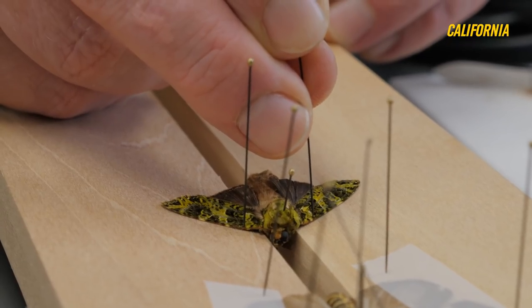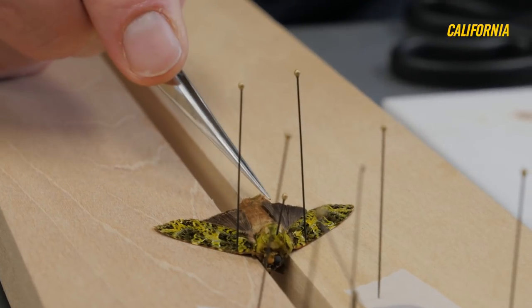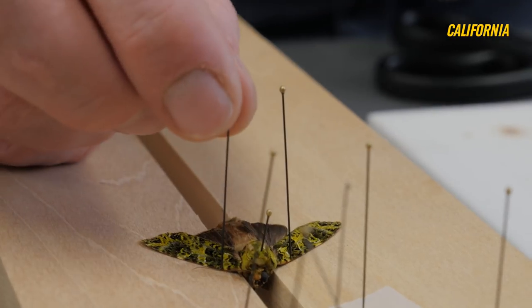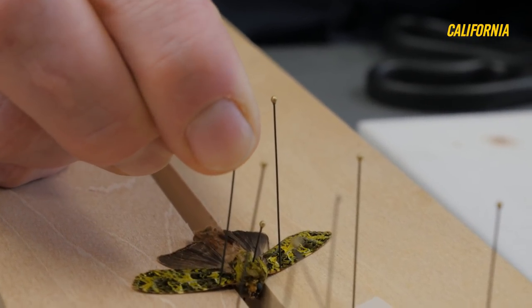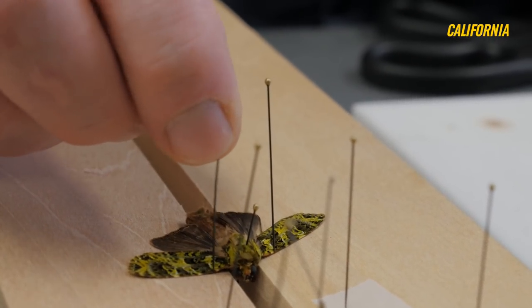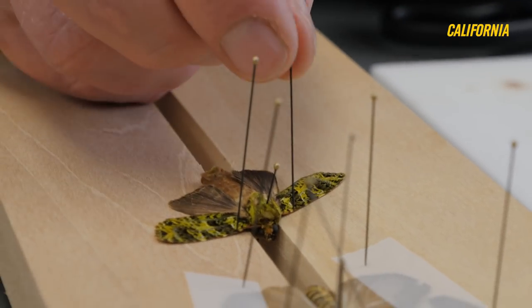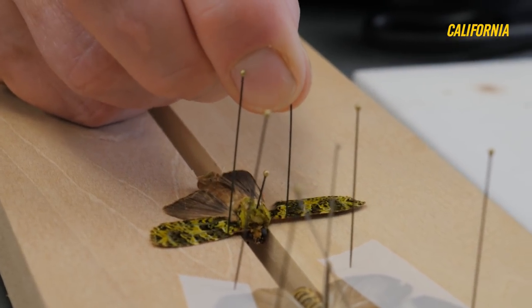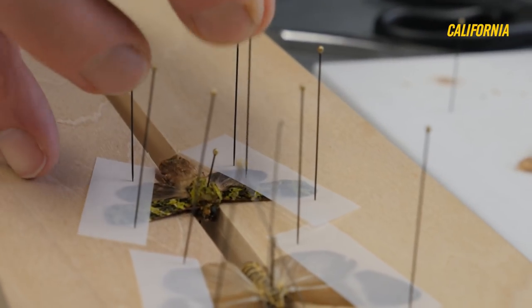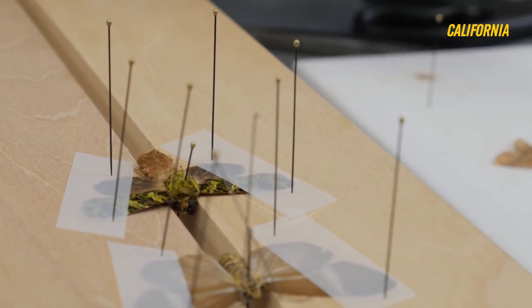These wings have veins running through them that give them their structure and rigidity when they're flying. I'm putting the pins right behind some of these thicker veins — otherwise I would tear right through the wing. By putting the pin behind those nice strong veins, I can pull the wing into position. Now we'll just let this sit for two or three days — probably one day is enough, but I like to give it two or three days for them to fully dry in this position.